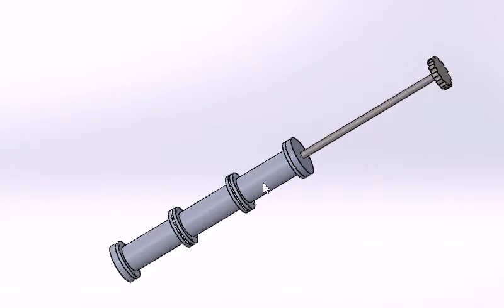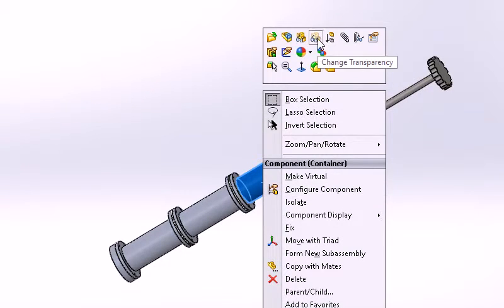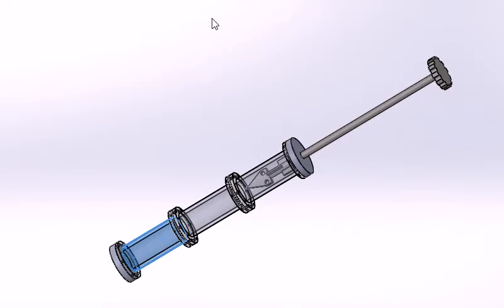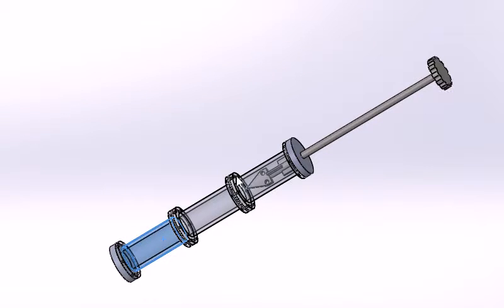I will go ahead and change the transparency of each of these so we can see that this geared actuator actually penetrates each of the physical barriers and then goes on to rotate at the same time in order to add some mixing effect.